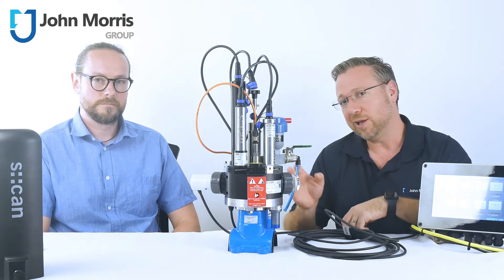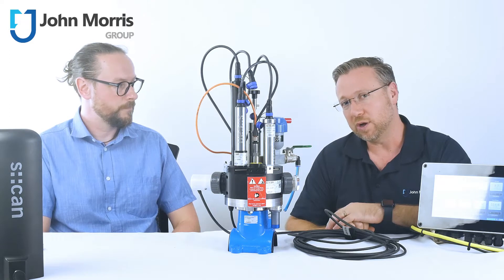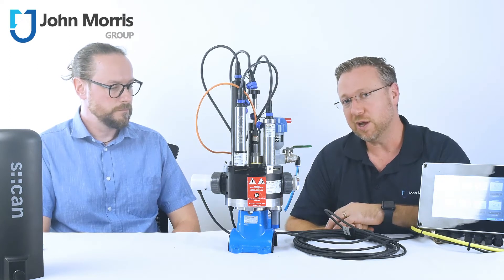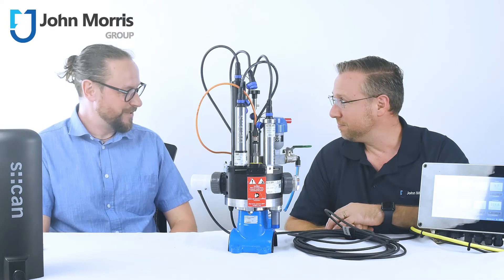But today we're going to be looking at the PipeScan, which is a product aimed at potable water analysis in distributed networks. Hi Sven. Hi Andre. I'm wondering if you can tell us a little bit about it. What is the purpose of the PipeScan?